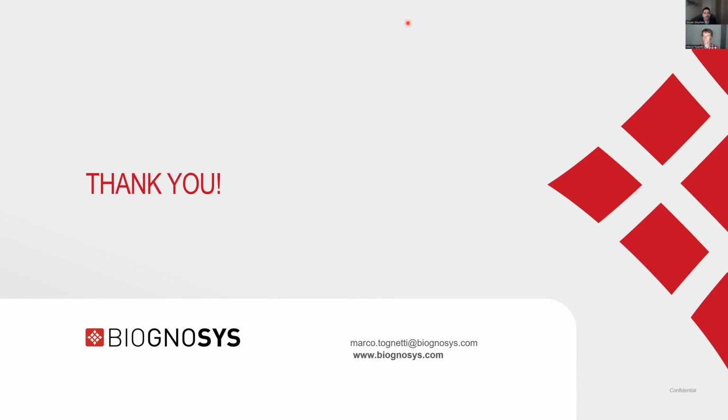And can I maybe also ask about the importance of the actual database to build your library? Because in the case of actual patient samples, they will each have kind of an individualized custom database in a way because of the mutations they might have. Is that something that you have to build? Yes, that's something you have to build. And what we do is generate a library from all the samples so that you don't need more material. So we take a small aliquot from each sample and then do fractionation of those samples to generate a library that we then can match to the different searches.